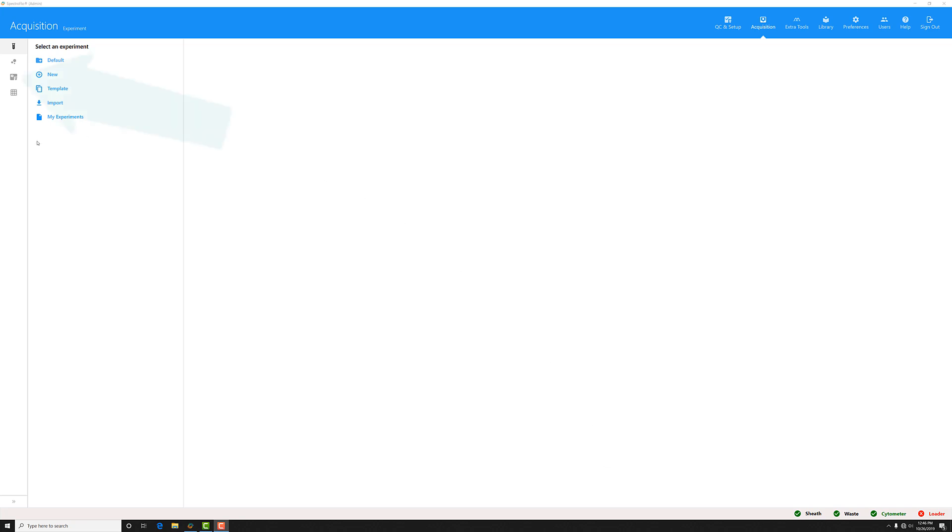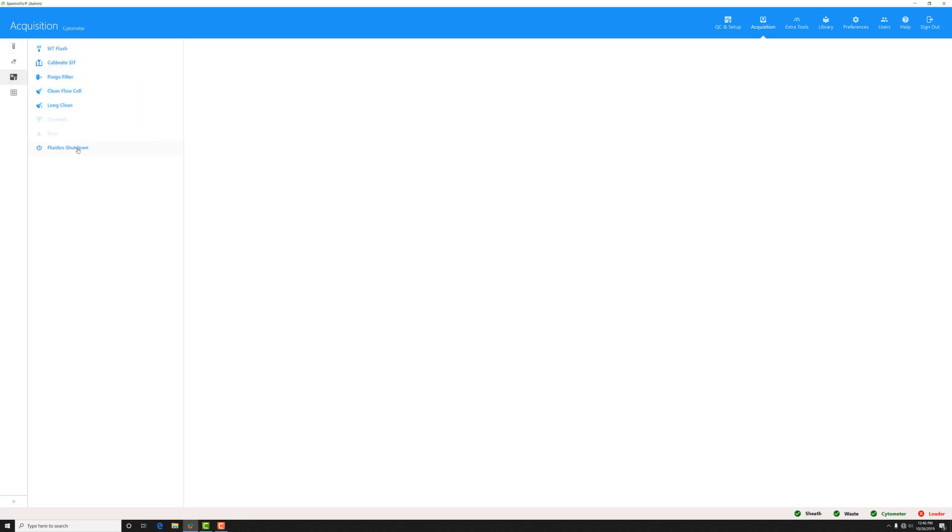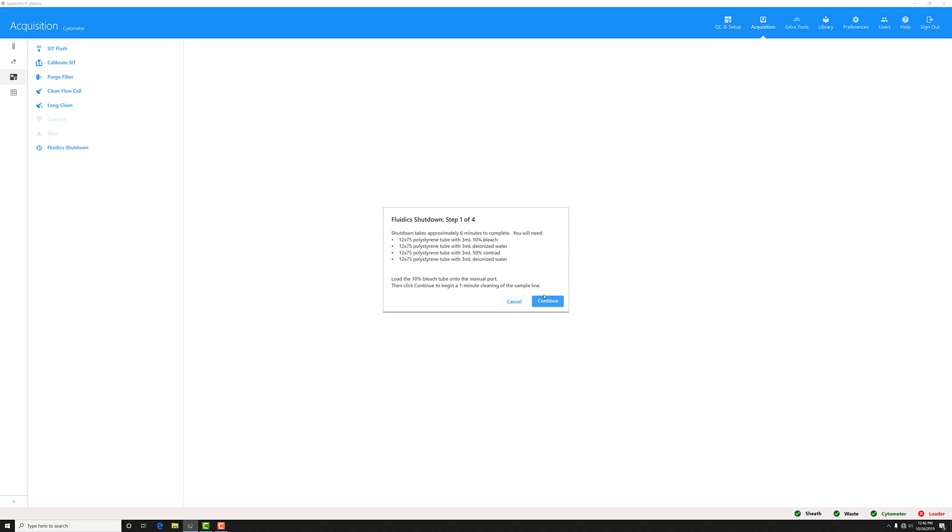To do this, in the acquisition menu, go to the cytometer menu and click fluidic shutdown. There'll be a series of prompts like this one that'll guide you through the workflow.